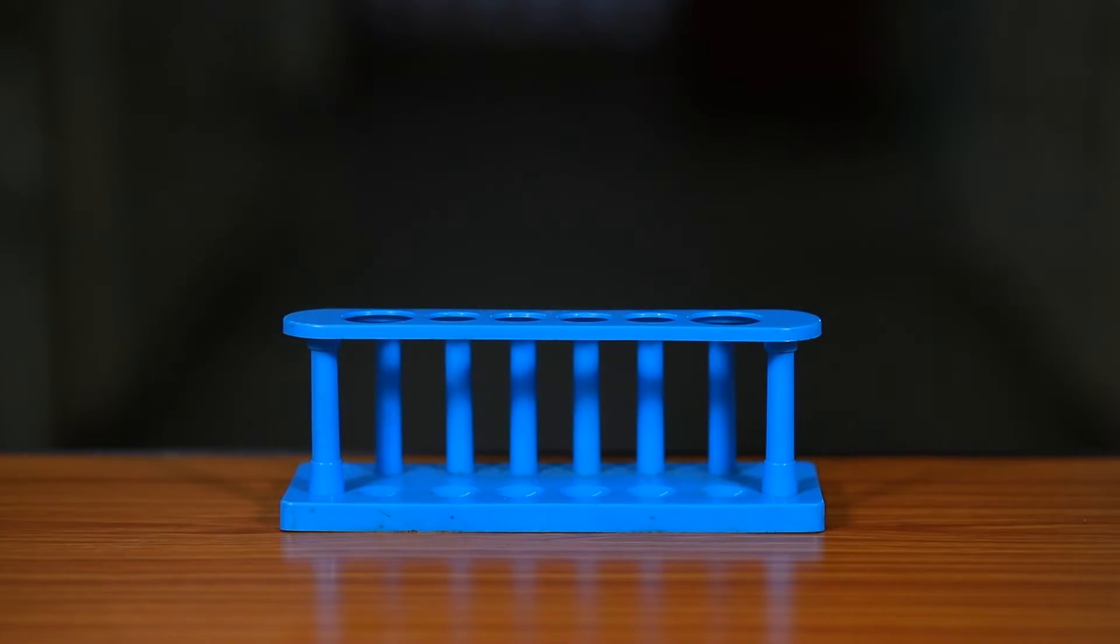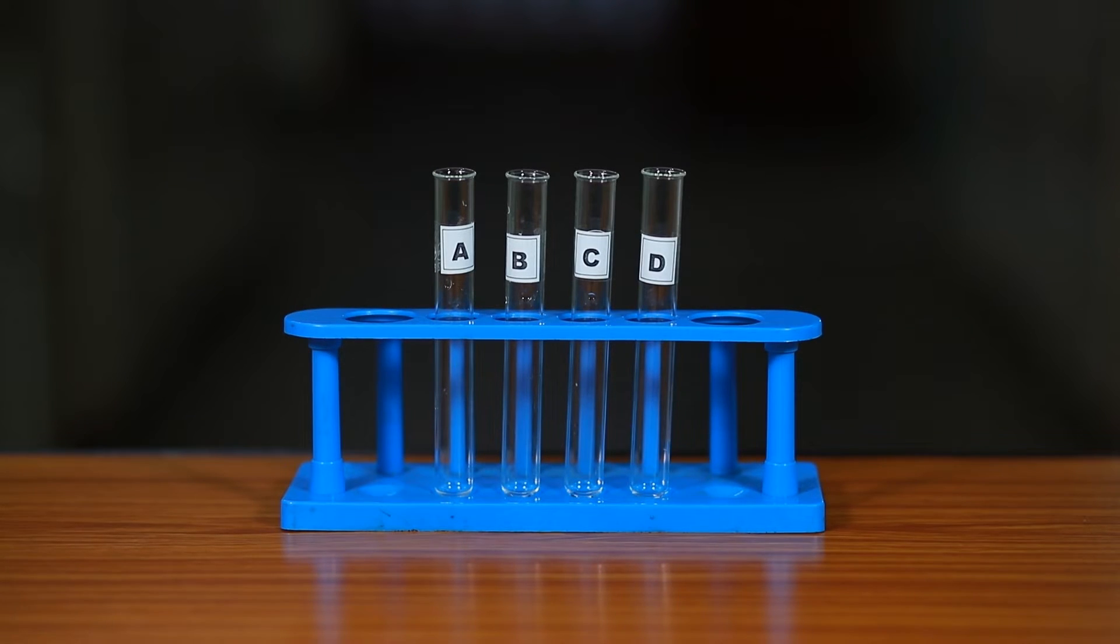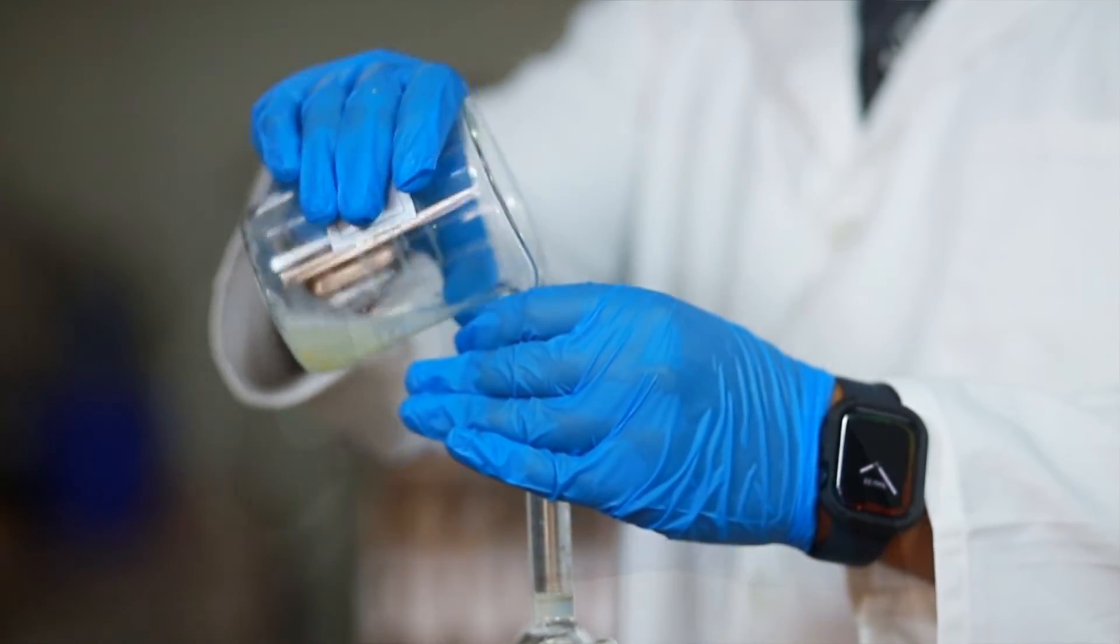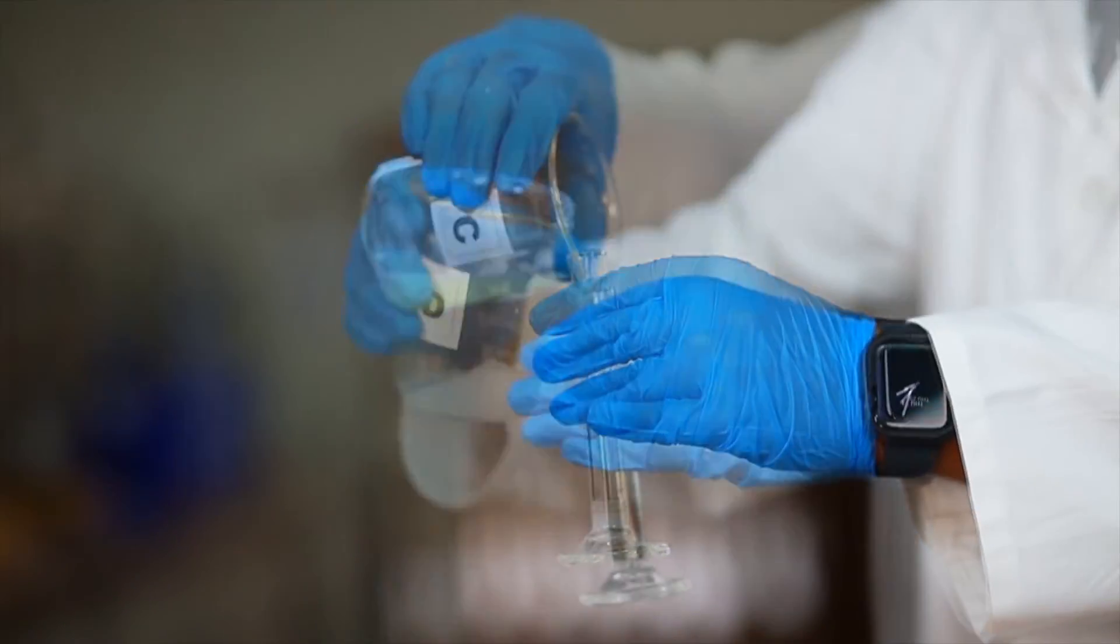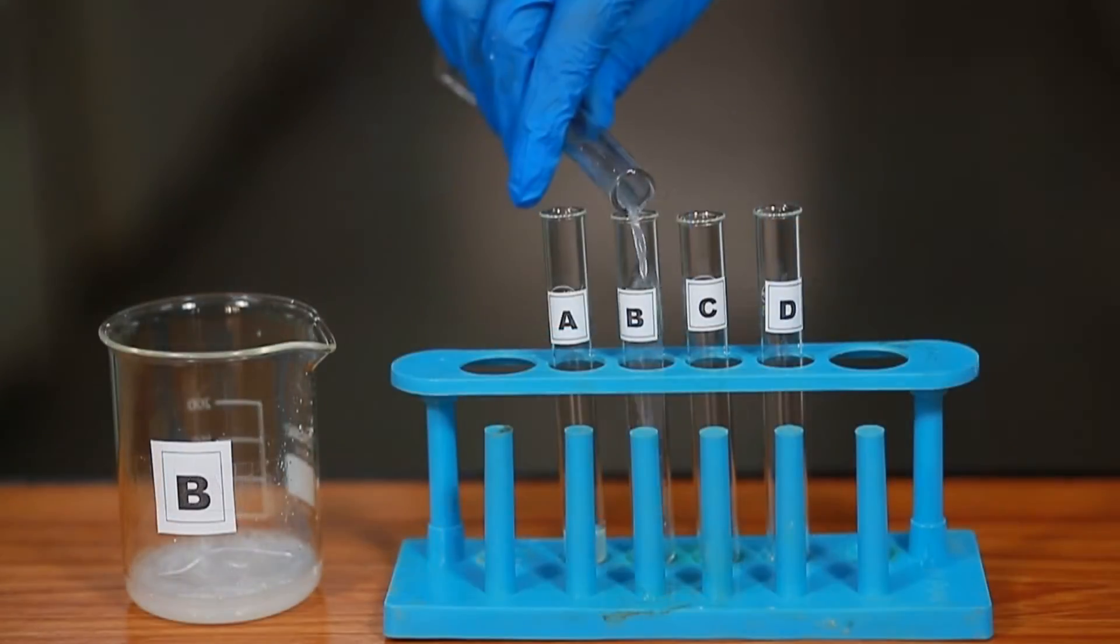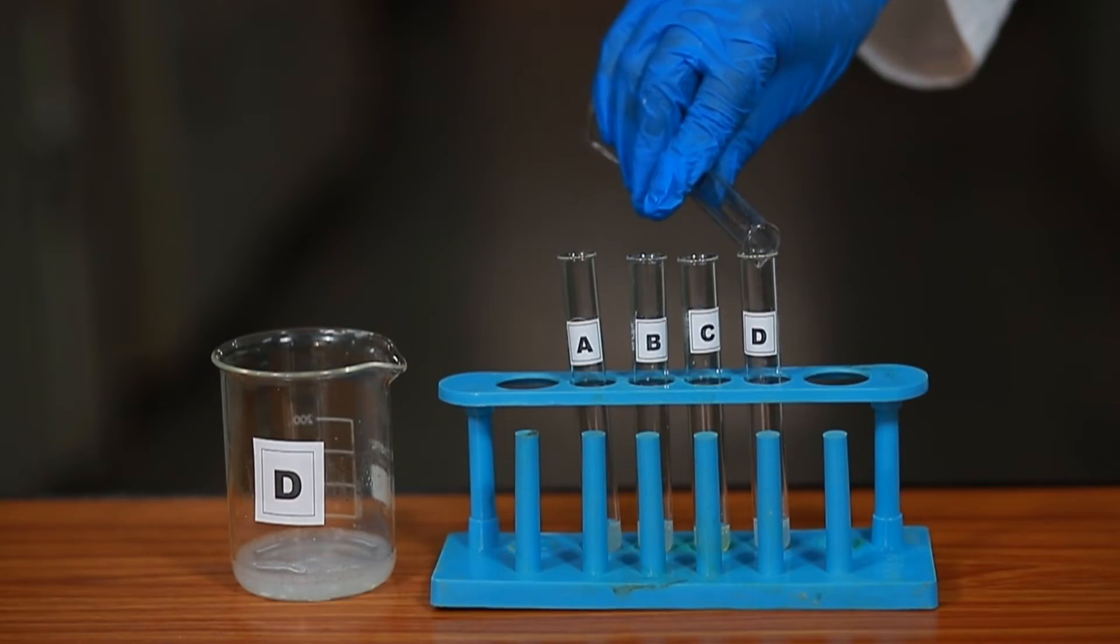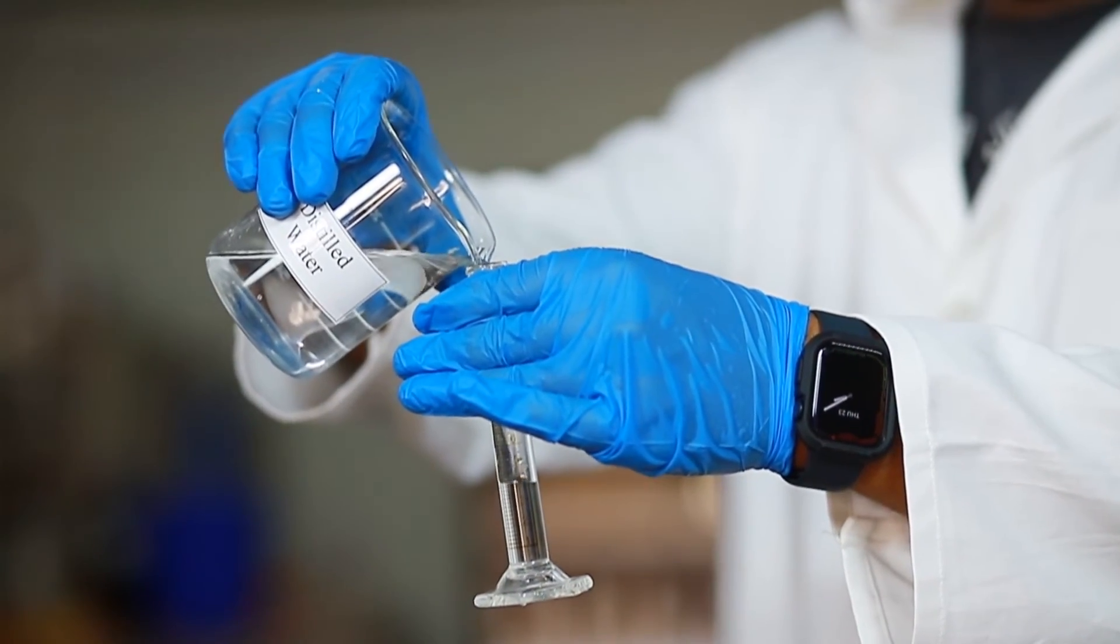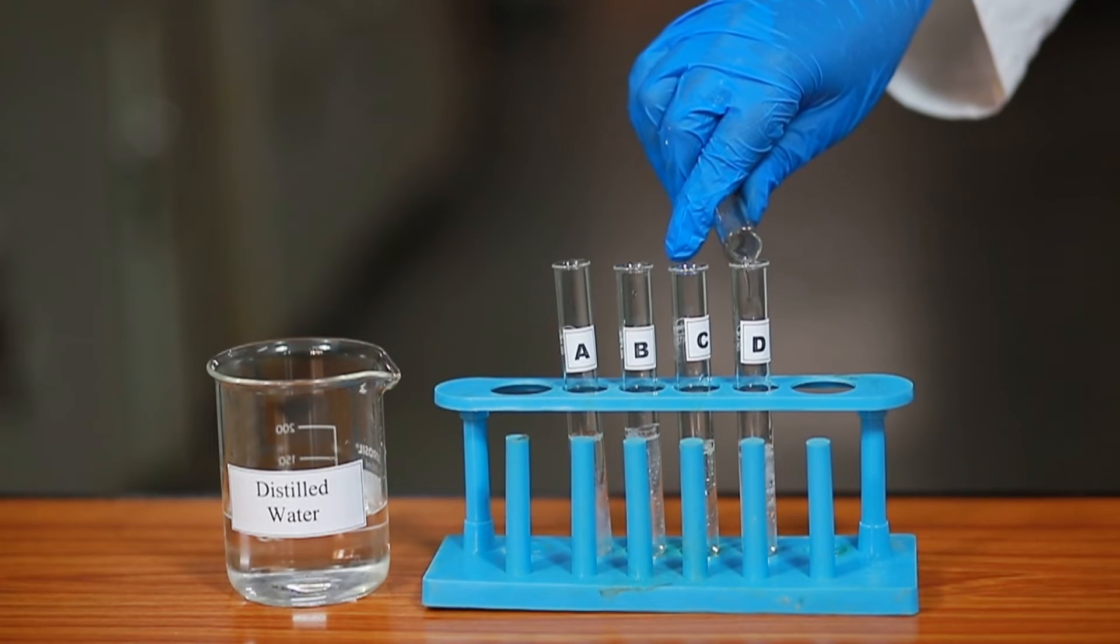Take a test tube stand and place the four test tubes. Label them as tubes A, B, C, and D. Pour one ml each of the above prepared soap solutions using a measuring cylinder into the corresponding test tubes. Add 5 ml of distilled water from the 250 ml beaker to each test tube using a measuring cylinder.